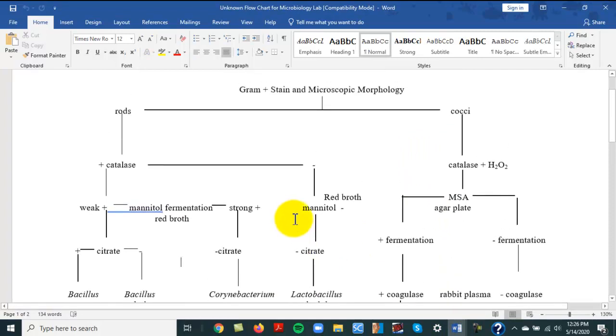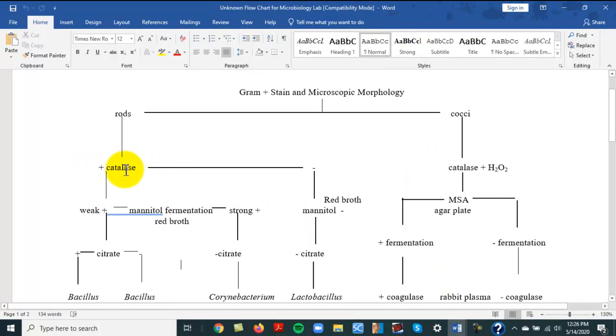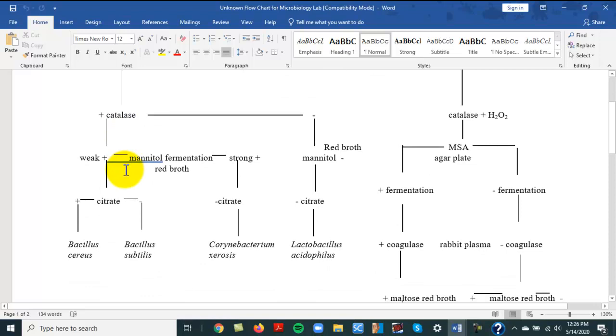So you go back. So we already did the catalase. You don't have to let that incubate. Now, your phenol red broth was definitely positive. See, it says strong plus. Once again, you can refer back to the diagnostic media unit. If you don't remember, with the phenol red broths, and I put this at the bottom of the page, there is what is called a weak positive, which is what that's referring to, reaction. And the broth is red, but if it's a weak positive, it turns orange.